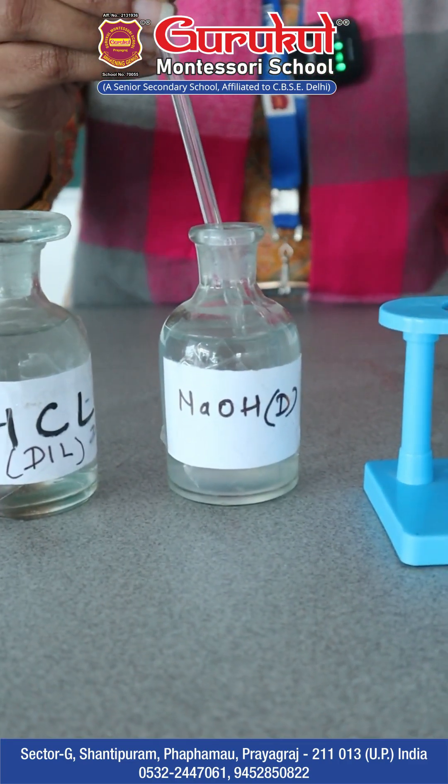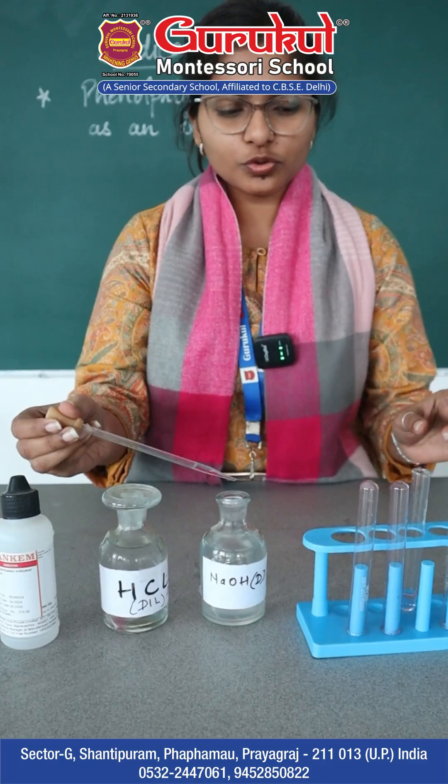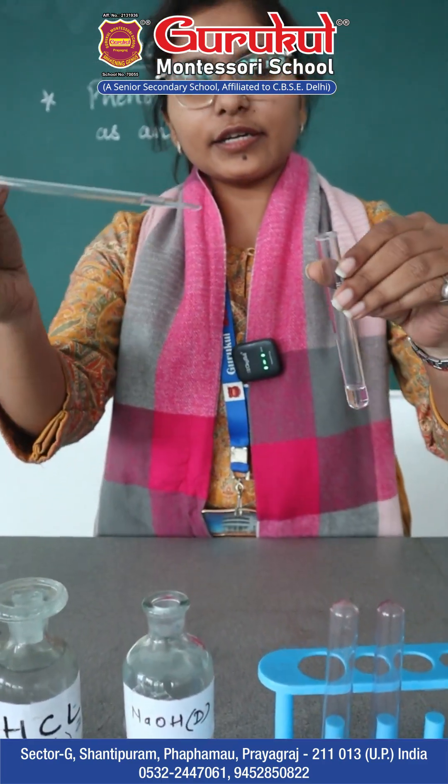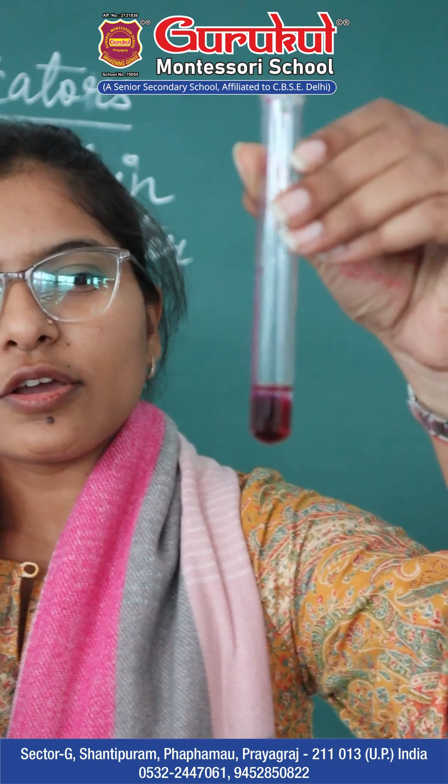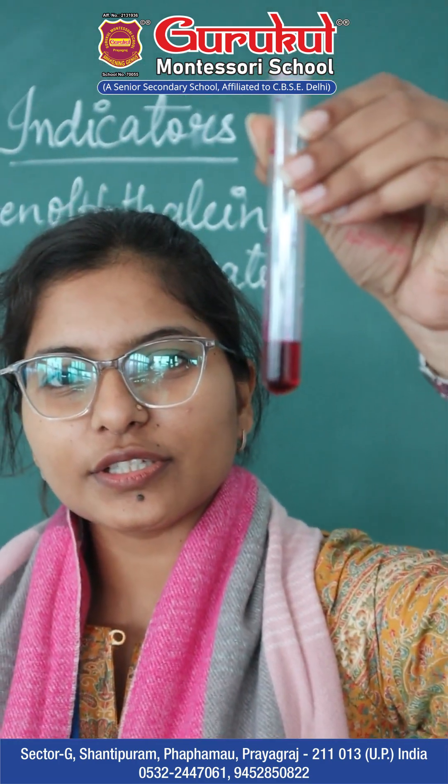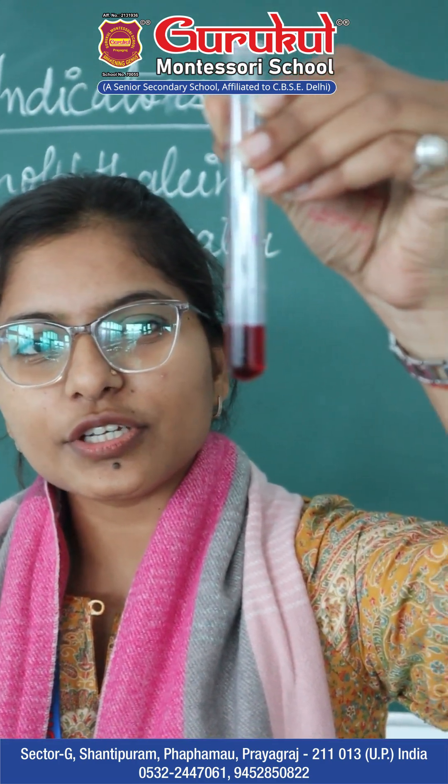Now with sodium hydroxide as the base, I will take two to three drops and add it into the next test tube. On mixing, can you see the change in color? It has changed to pink.